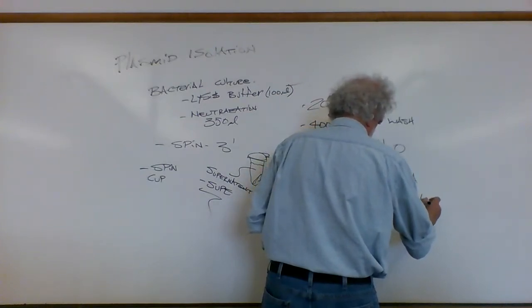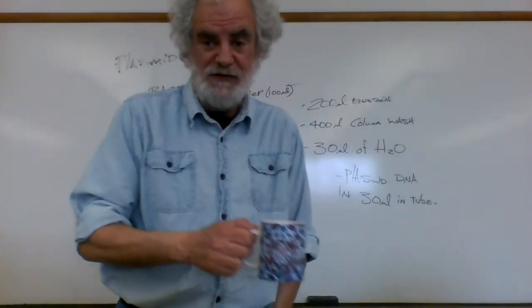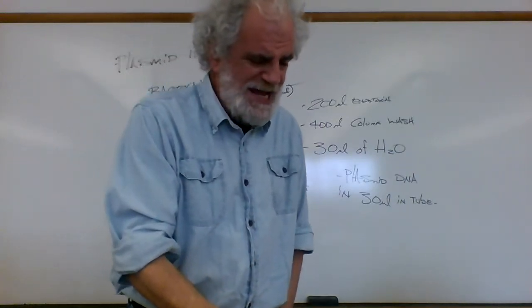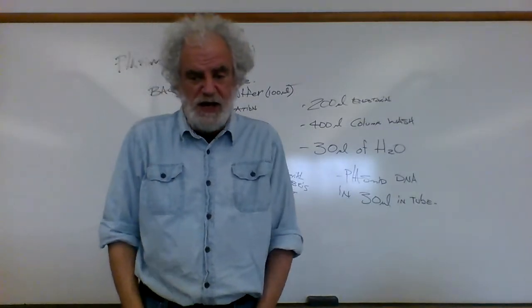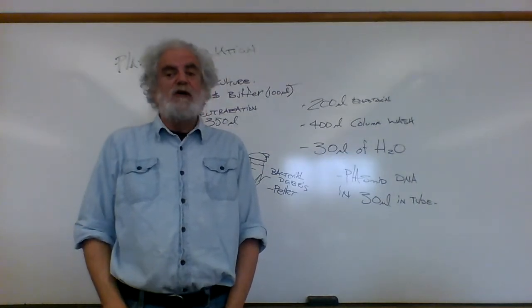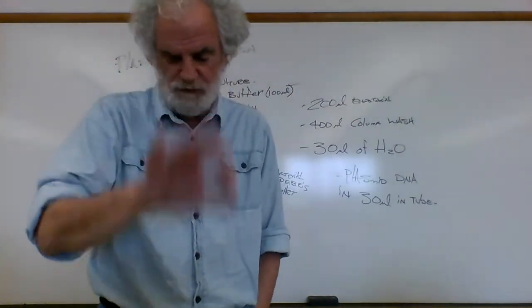All right, so now you have your plasmid. What we're going to do next is actually quantify the DNA. Next week we're going to take this DNA and put it back into bacteria, and we'll talk more about plasmid biology next week. But this week it's nice to know the actual amount of DNA in micrograms per microliter or micrograms per mil, whatever units.